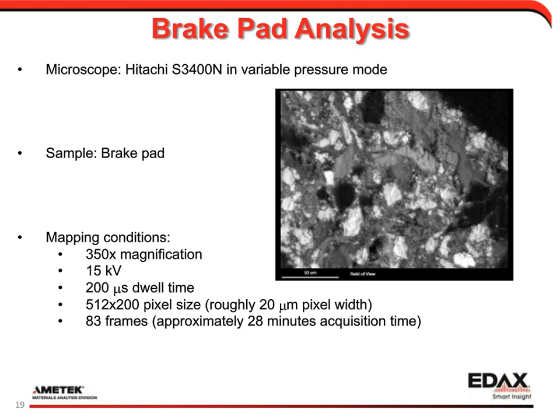Often people gold coat or gold-palladium coat their samples to get nice imaging. That has some not so nice effects on the EDS spectra. Gold is strongly attenuating compared to carbon, so you will have to apply much, much higher correction factors, which will induce higher error rates in your statistics if you use gold coating.